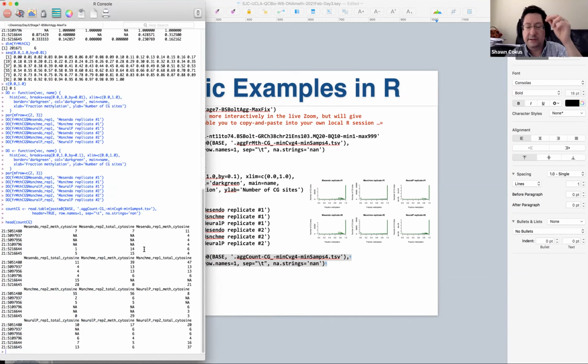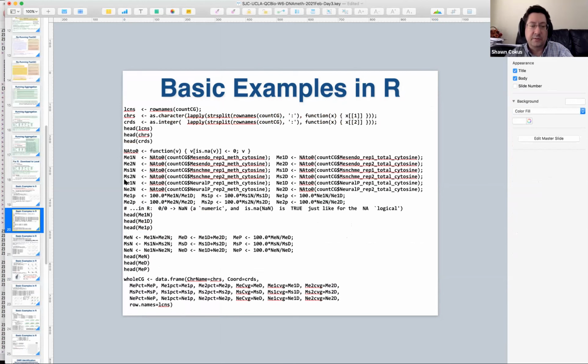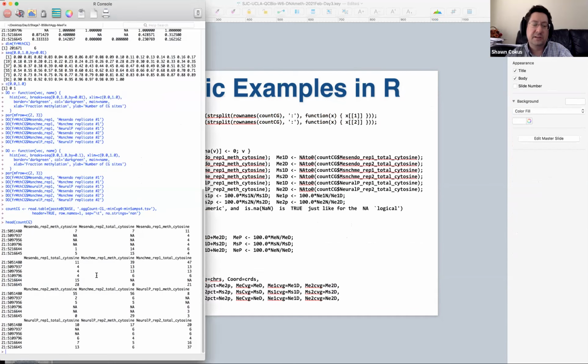And it's all integers, with the numerators and denominators that we would formally look at as fractions. So first thing to do is let's mush this thing up into something that's nicer. These column labels are kind of horrible, and we'd like to have all the data available all at once. So that means I would like the ratios, the fraction methylations, in there. I don't really need the numerators. I'd like to turn the numerators into the fractions, basically. Keep the denominators, that's basically coverage, rename it coverage.